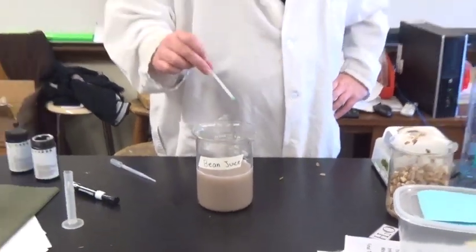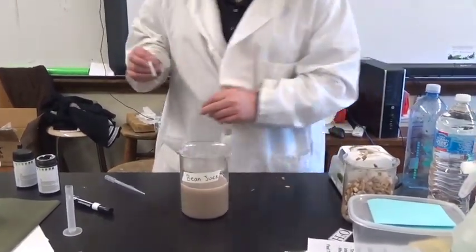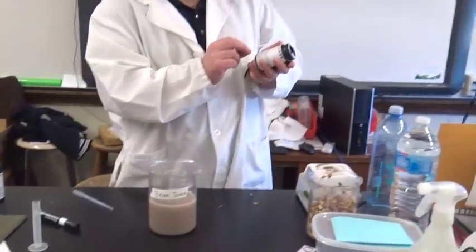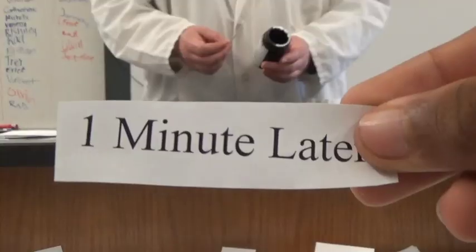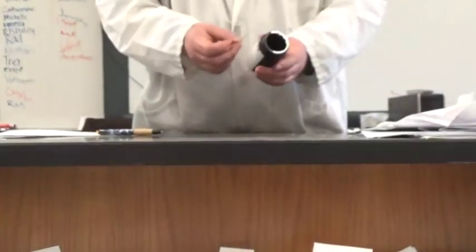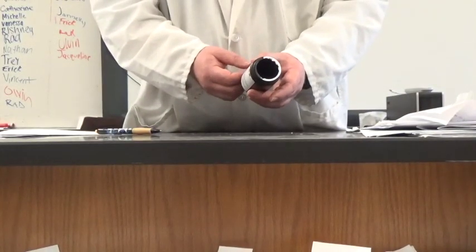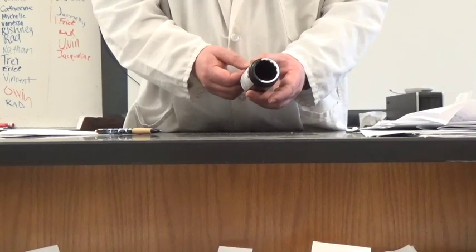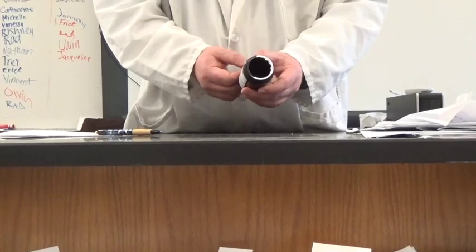I'm going to pull it out. After one minute, I will then compare it to the standard to see the actual amount of glucose. The result is negative glucose, and in science, negative means zero. So there are zero milligrams of glucose in bean juice.